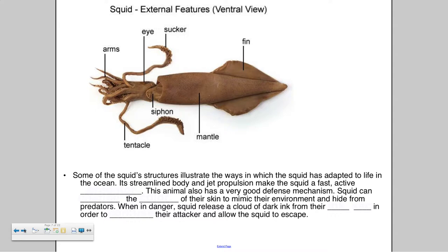Can you hear me, though? You can hear what I'm saying, so you really don't need to see it. You can hear it. All right. This is still with the squid on its back and its stomach facing up, so everything is still the same there. Savani, go ahead and read that for us aloud.